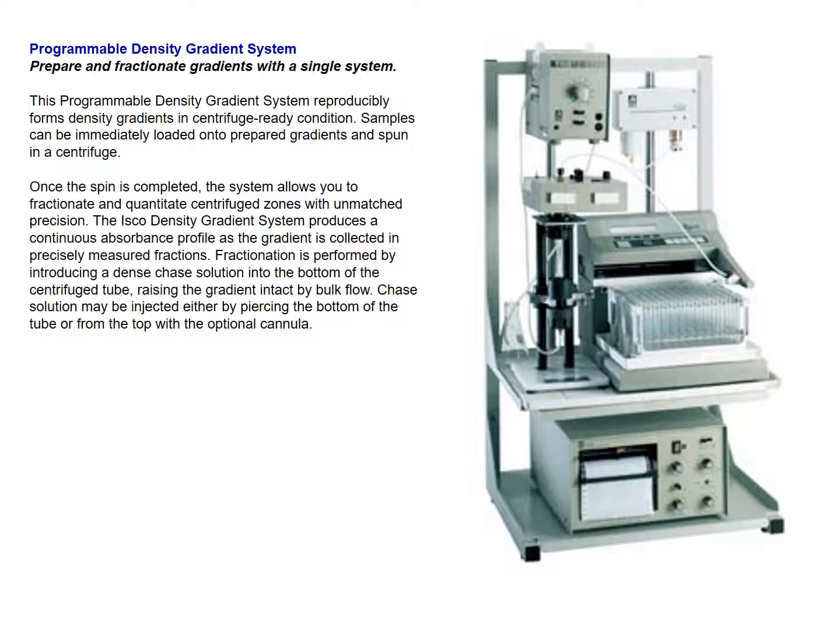Okay, just going to introduce fraction collectors. It's hard to see. There's a flask with your homogenate, with your centrifuge bands, with your material. There's some tubing that goes into here. It's got to be sterile. You don't want it fungal and infested. And that tubing goes up and is pumped. So there's a vacuum and material is pumped up from your sample here.